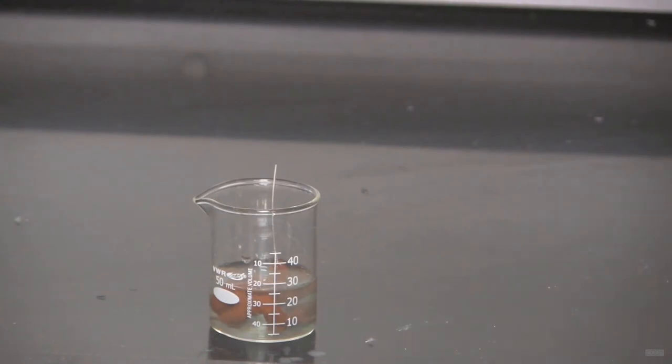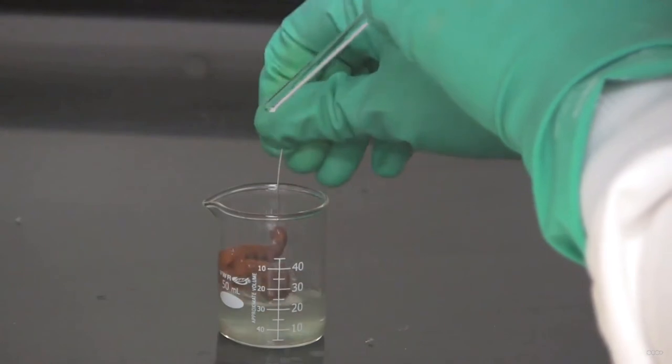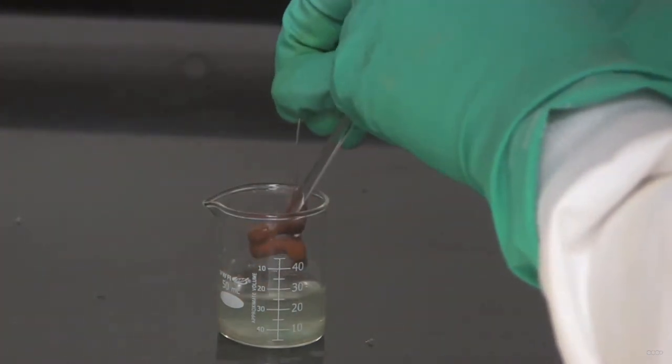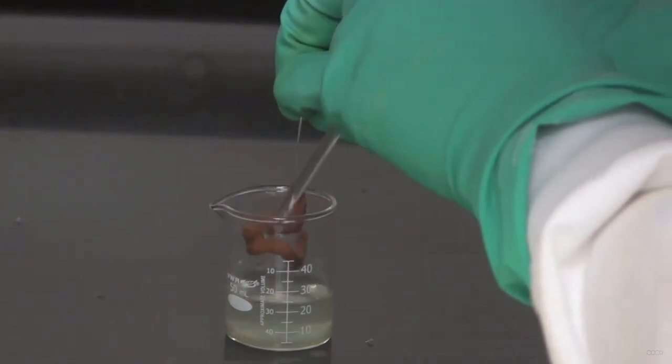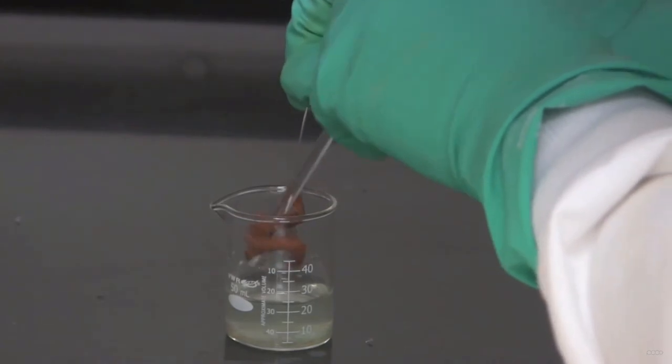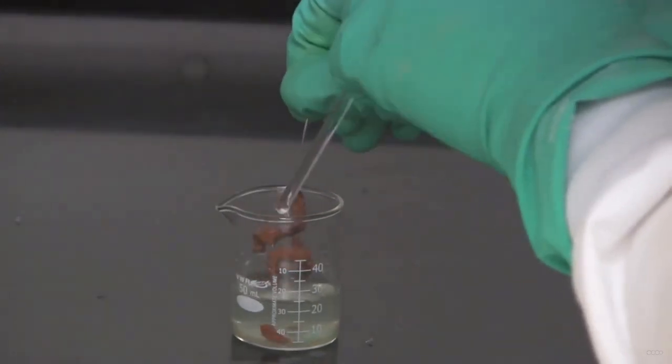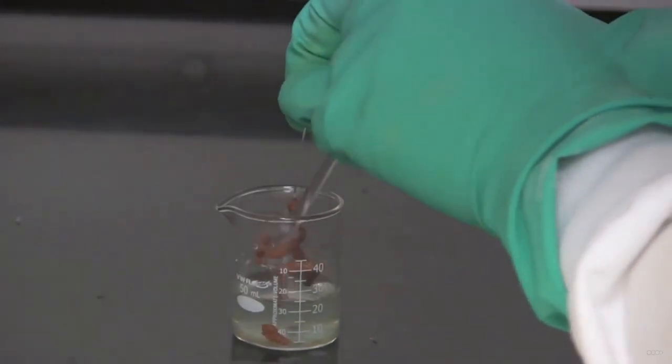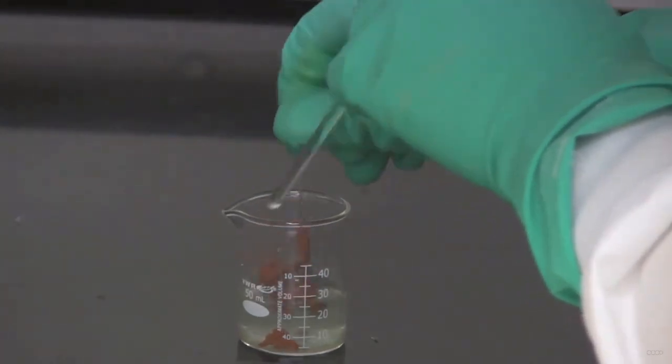Now what I want to show you here is how easily the copper comes off the aluminum wire. And you can see I'm just using a stirring rod here, a glass stirring rod. And you can see how it just sort of flakes off, flakes off the wire.